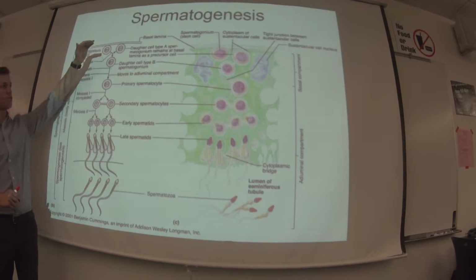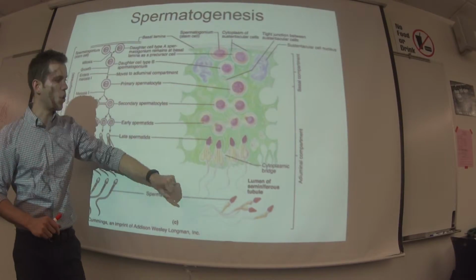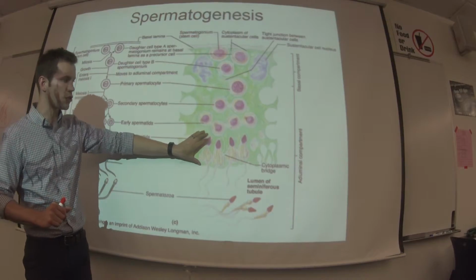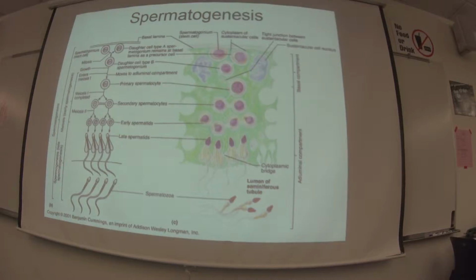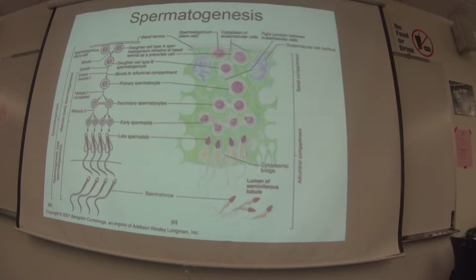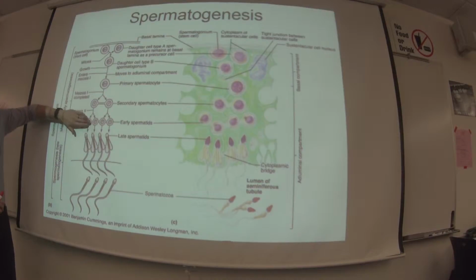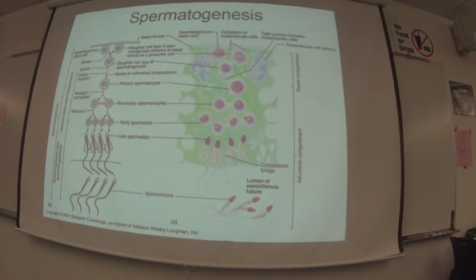So it's either a spermatogonium, spermatocyte, or our 4th type of cell, but 3rd one that you'll have to identify under a microscope, a spermatid. It's like a toddler sperm. It barely moves. It is really dependent upon the cells around it to stay alive, but it begins to look like sperm rather than these individual nice spherical cells. And I do want you to be able to point those out on a slide.